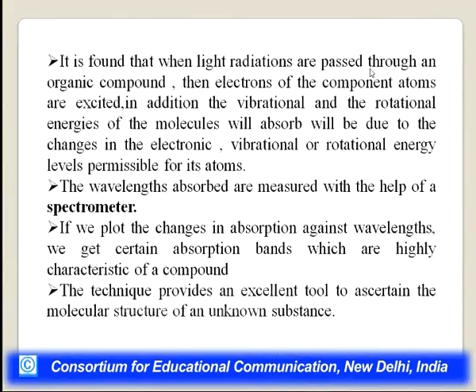The difference in energy. It is found that when light radiations are passed through an organic compound, then electrons of the component atoms get excited. In addition, there is a change in vibrational energy as well as rotational energy, and that will be observed due to change in electronic, vibrational and rotational energy levels, which is permissible. You cannot say that all vibrational or rotational energy levels get absorbed by a molecule. No, only IR active, only a few frequencies or energies get absorbed by a molecule. It will be discussed in IR spectroscopy.